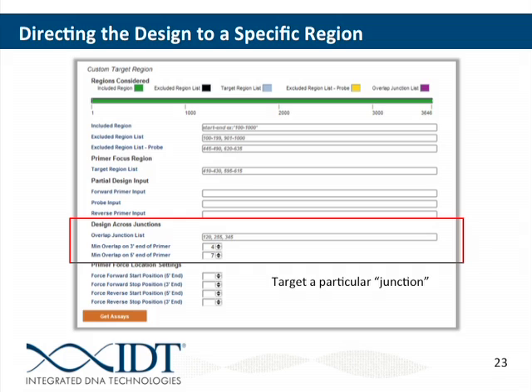Here you can increase the number of results that are returned. It defaults to 5. Often it's useful just to increase this to anywhere up to 50, but even 10 or 15 reactions, so that you have some reactions to look through and more choice in where those are located. You can also vary how variable the primer locations are in the output. So either the forward or reverse primer, if you turn this up to high, then they're going to be spread throughout your sequence more, or low, they're going to be targeted more specifically.